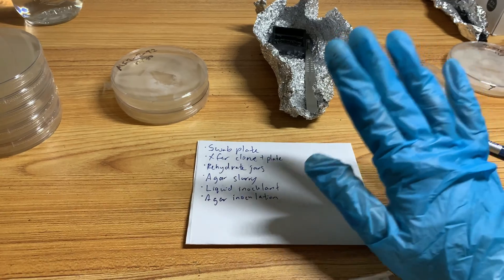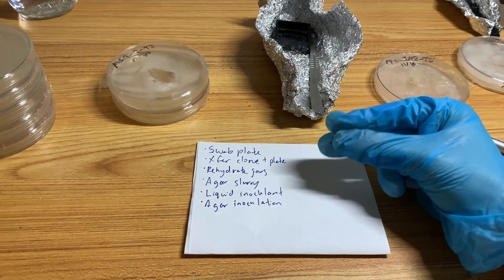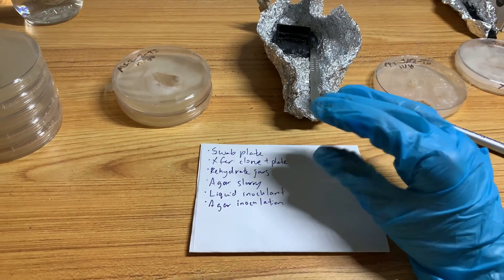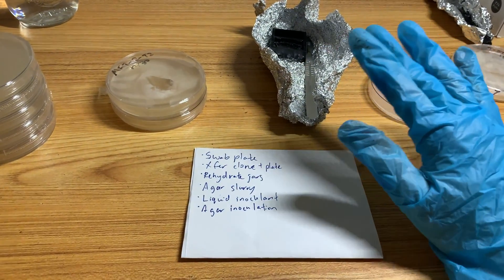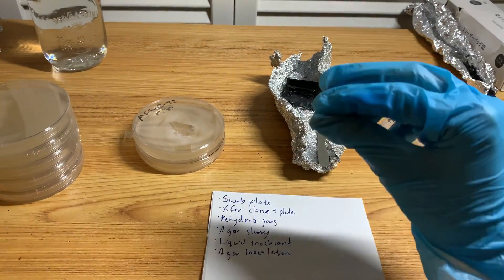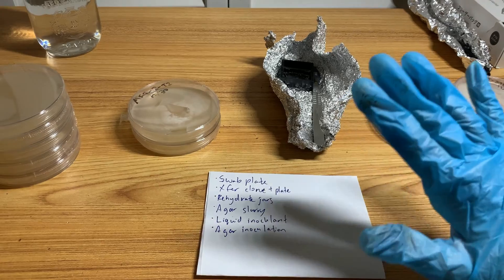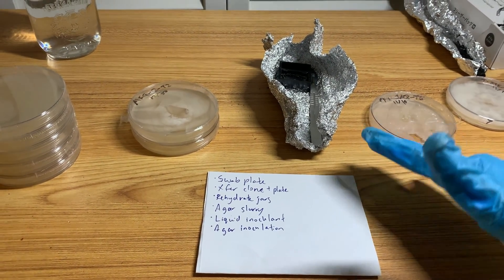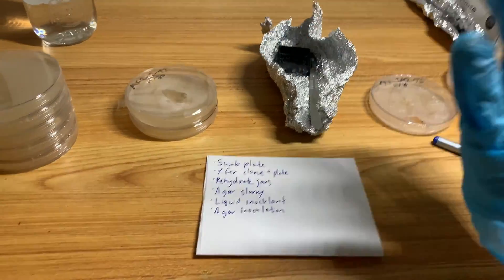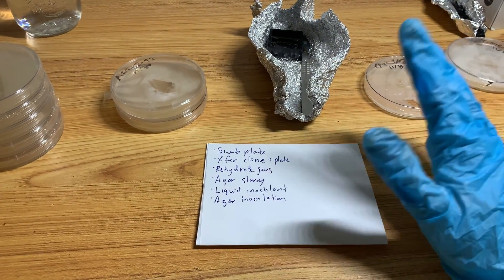Remember guys, I see a lot of misunderstanding here. A SAB is not supposed to really be a sterile environment in the way people think. It becomes sterile via physics — it's not because you're literally killing germs. You spray the soap water, the soap sticks to all the germs and spores in the air, and they settle down onto the walls and floor of the SAB. That's why you generally want your SAB to be moist when you're working in there, because if it dries out, with movement it could go back into the air. That's why the walls of the SAB are so wet — although it's okay within a set period of time, you don't want to go too long without the walls being moist.